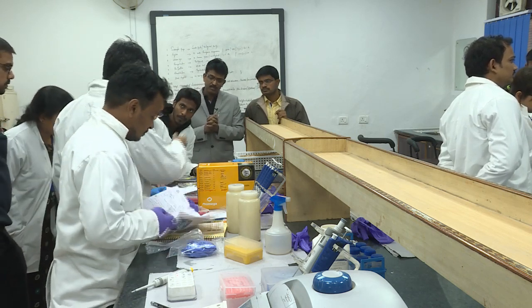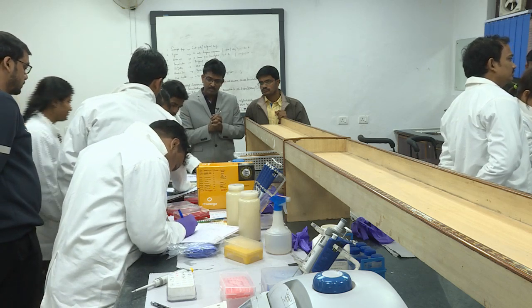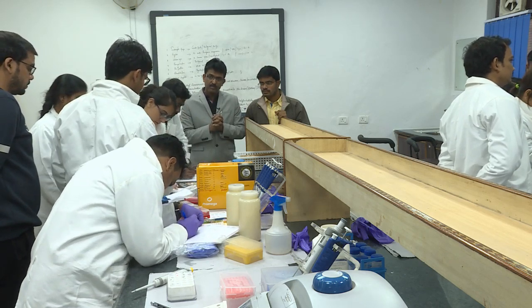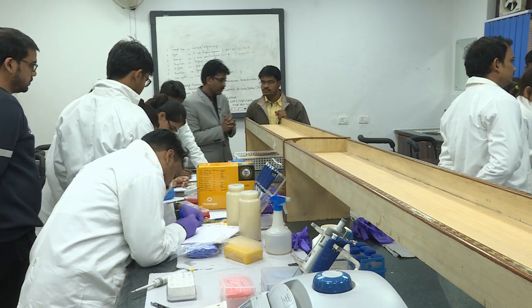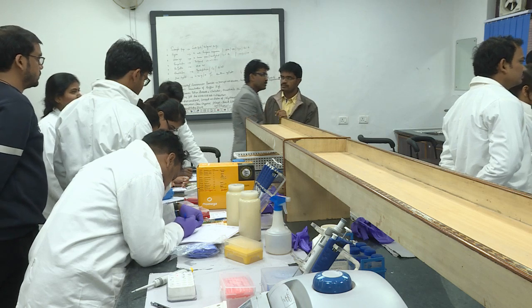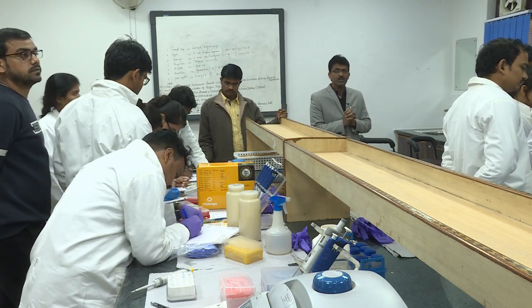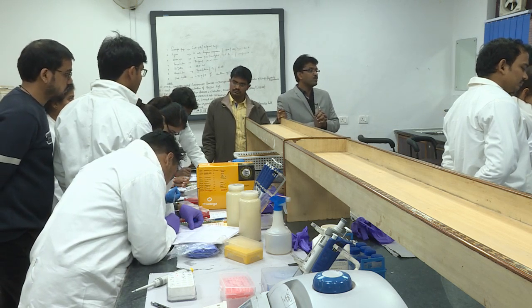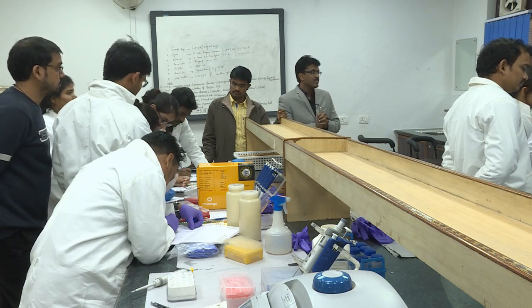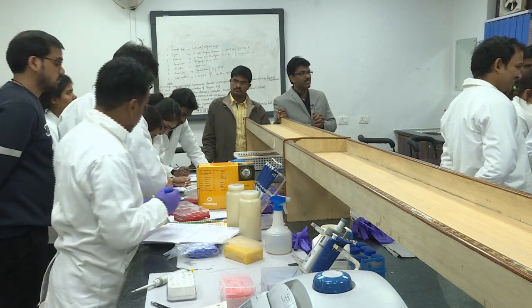Write down again in a sequence. You write down, I'll tell you. Like you write first in the extreme left, milli-Q water, MqH2O. You write. What about other groups? What's going on now? And then buffer, MgCl2. So we have the results from two groups, group number 1 and 5, MgCl2, right? Other groups are still struggling with the system, I think.